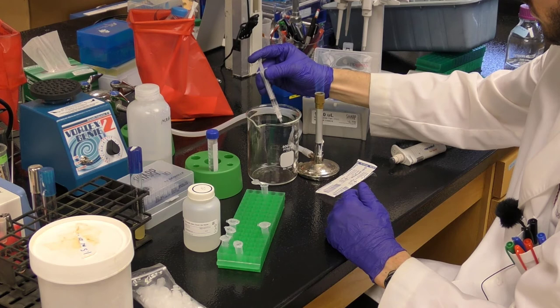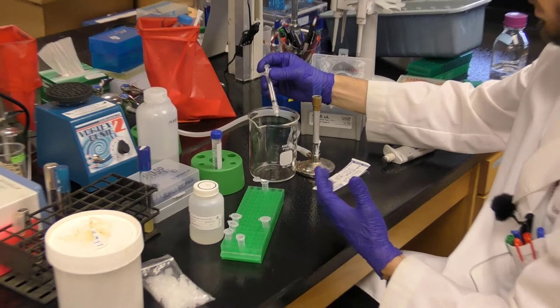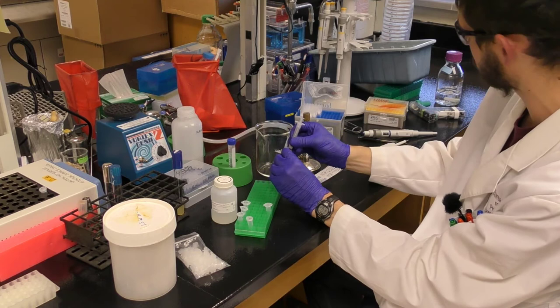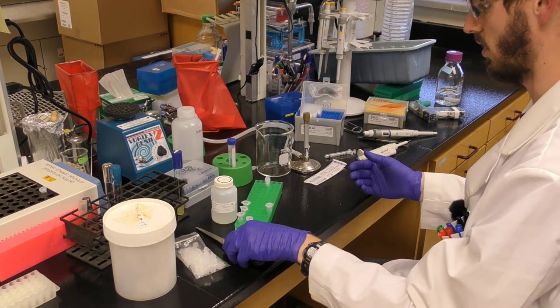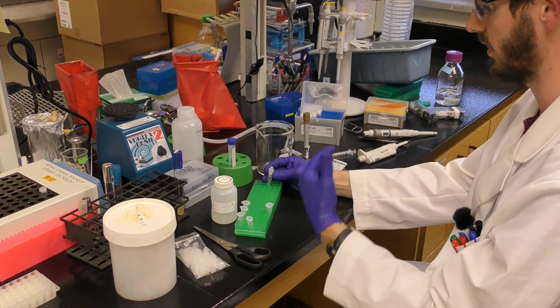Now we've done the two washes. At this point we want to dry the column before we add the water that's going to elute — if there's any alcohol left in the column it won't properly elute the DNA, which will cause a drop in yield. So we add it back in, make sure it's snug and nice, take off the syringe, then grab a pair of scissors and clip off the end of the cap. We're going to take this and centrifuge it in the micro-centrifuge for about 30 seconds at max speed. That's basically just going to pull air through to remove the rest of the isopropyl alcohol from the column.